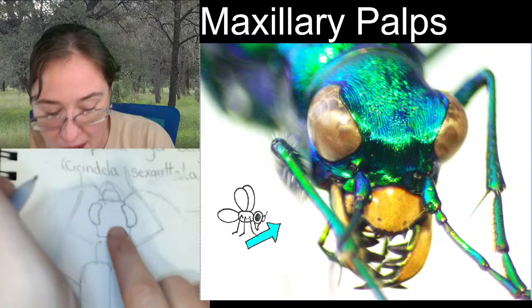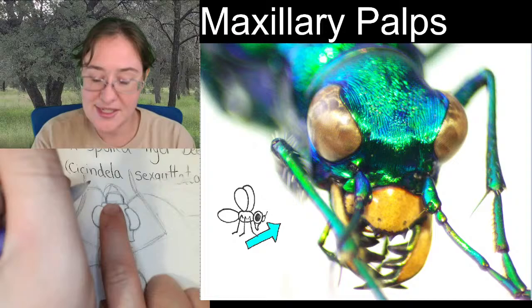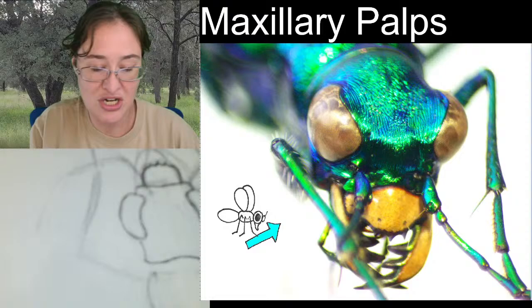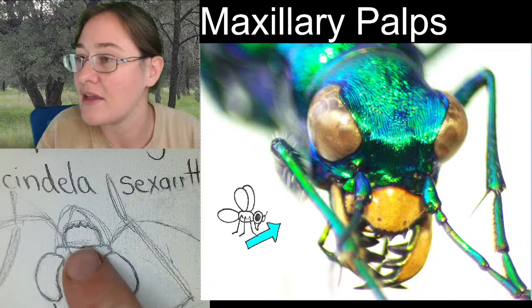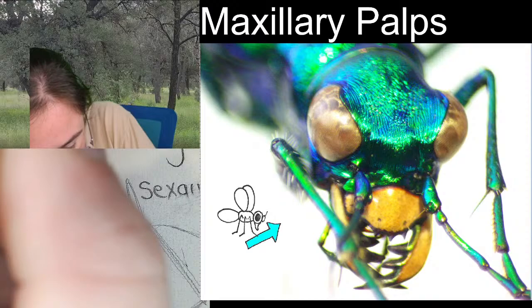Now, our labrum from the top looked a little bit like this angled rectangle here. So I'm going to pull it out like this, but then instead of just making it straight across, now that we've seen it, we know that there are these three very unique spines on the top of the upper jaw, and I want to make sure that they make it into our sketch. So I went ahead and added those three spines here. Let's see if I can get my paper to look right. There we go. So we've got those taken care of up here. We could go ahead and sketch those two little spots on the labrum.